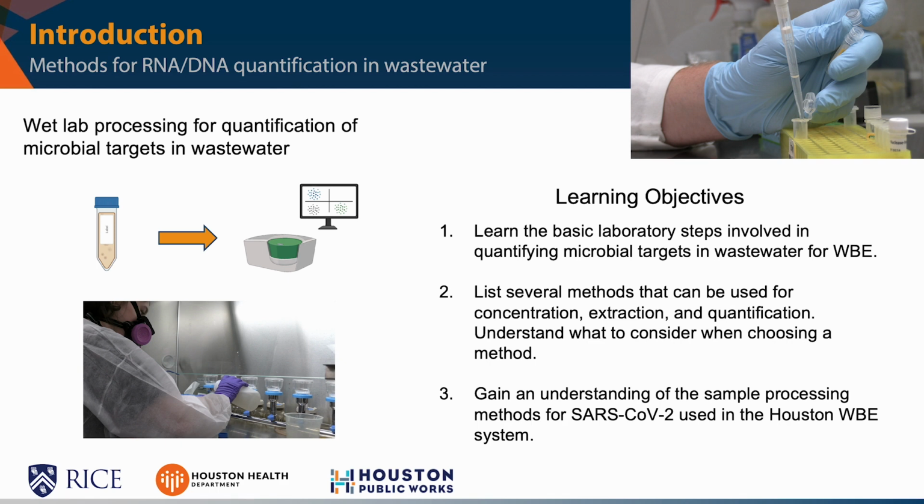There are three main learning objectives for this module. These include learning the basic laboratory steps involved in quantifying microbial targets in wastewater for wastewater-based epidemiology, becoming familiar with different methods that can be applied for the concentration, extraction, and quantification stages of the laboratory workflow, along with some things to consider when choosing a method. And lastly, I'm going to show a video which will help you gain an understanding of the sample processing methods specifically for SARS-CoV-2 used in the Houston WBE system.